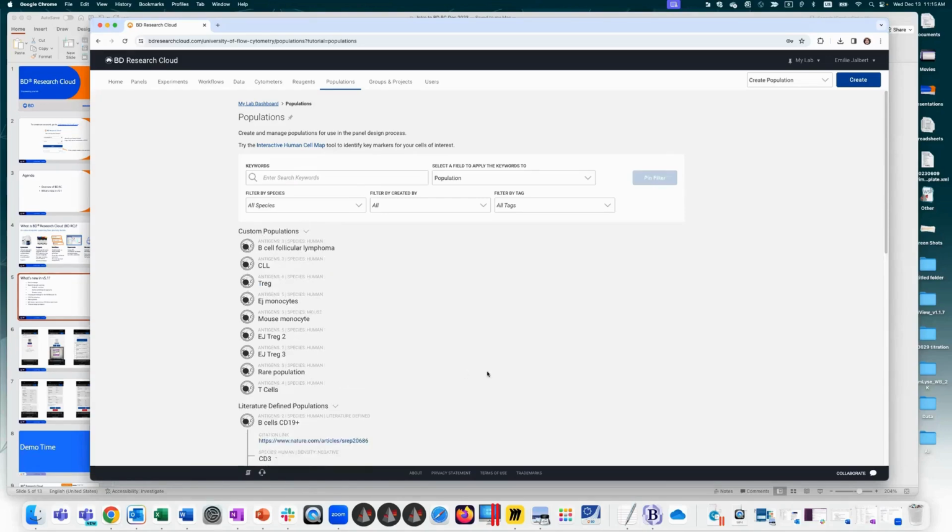We realize the antigen density can change drastically based on your cell type, your conditions, the isolation type that you chose. So the source of those cells can really affect antigen density. So based on your specific conditions that are being used in your lab, you can upload the antigen density information and specific markers that you tend to use to identify cell types.